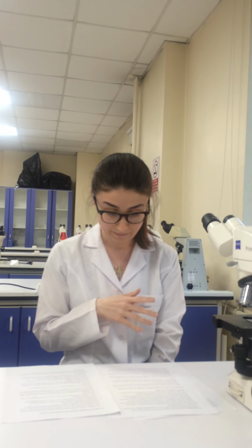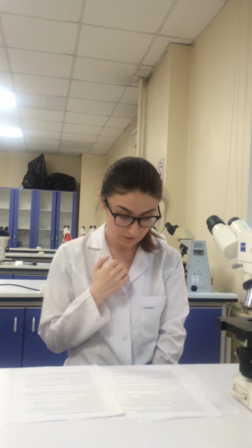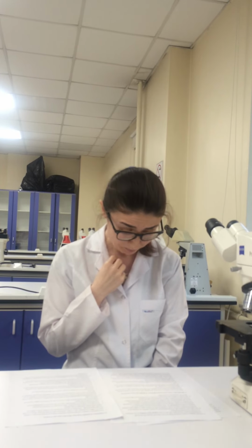Cells are collected in a new 15 milliliter conical tube and then centrifuged at 400 xg for 7 minutes. The supernatant is decanted and the pellet is washed twice in 3 milliliters of ice cold wash buffer using resuspension by pipetting, followed by centrifugation at 400 xg for 7 minutes.